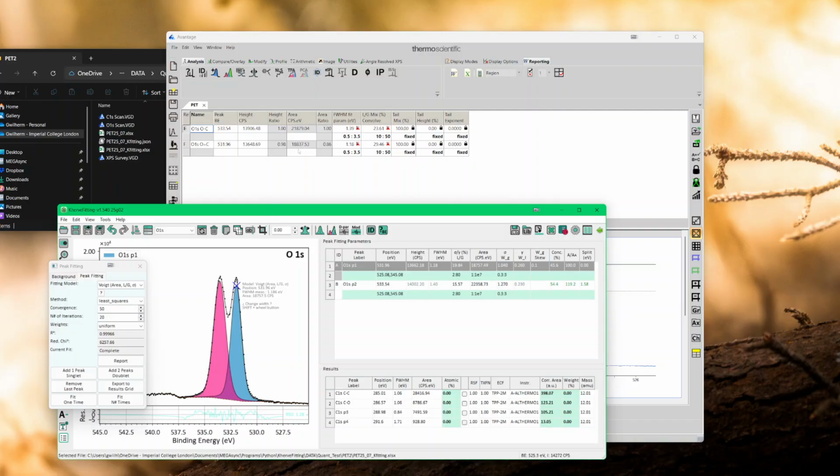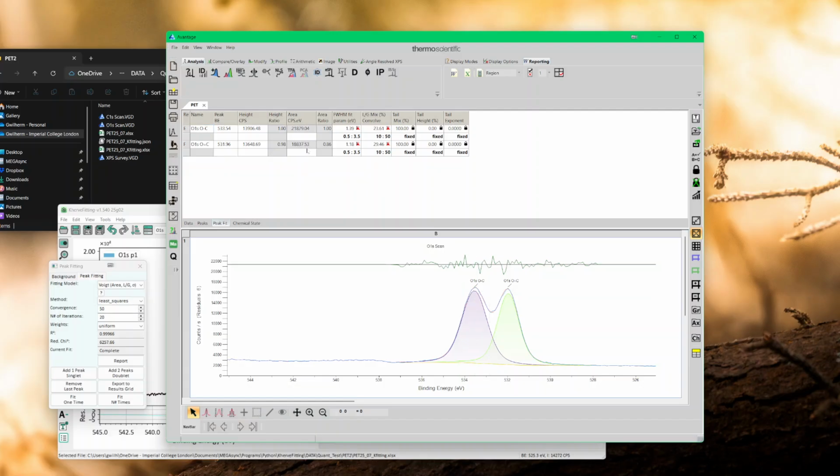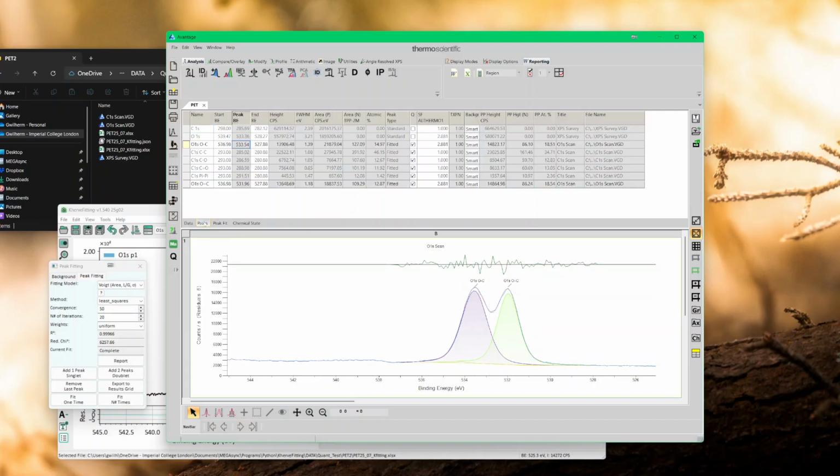And I found 18,837. So that's actually quite a good comparison, because now the corrections for this one, which is 18,837. So let's see what this 18,837 gave.